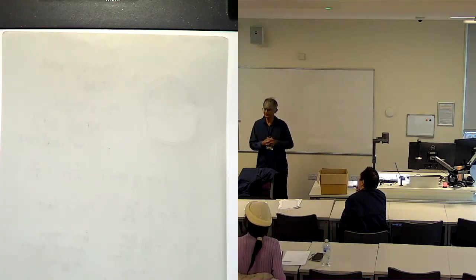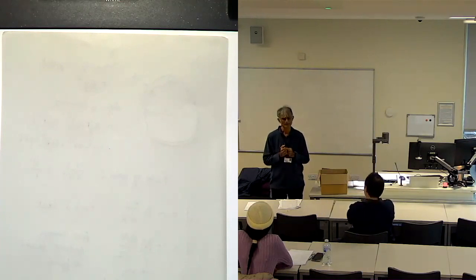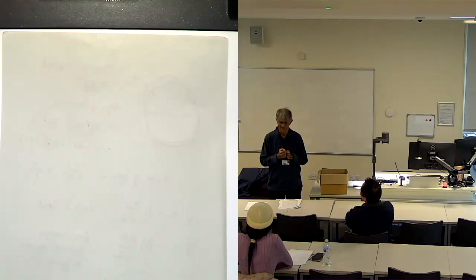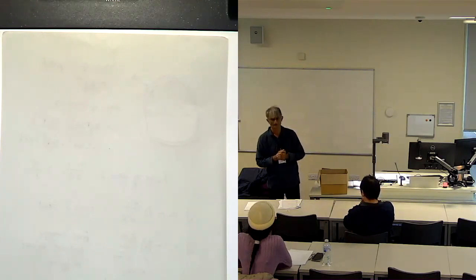So how are the X-rays actually generated? Any ideas? That wasn't a part of the practical question, but I just wondered if you know how X-rays are generated. Radiating material? It's not actually radioactive material because probably we are not allowed to use it. Okay. Some wavelengths reflected. Yeah, I mean we are generating specific wavelength, right? Well, there was electron bombardment on a metallic object.